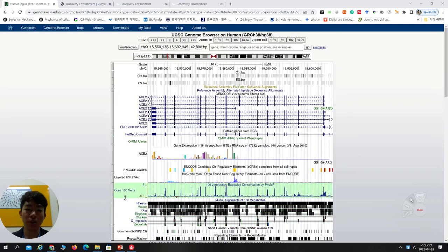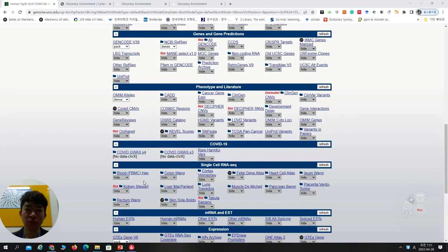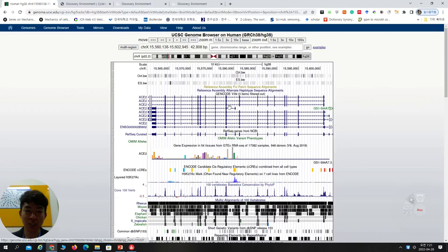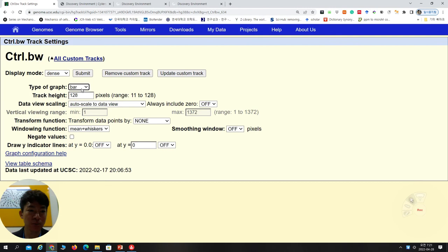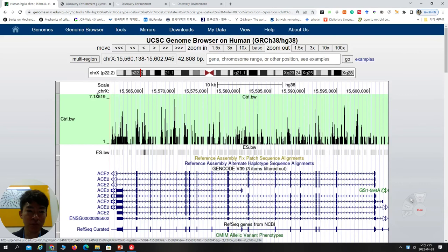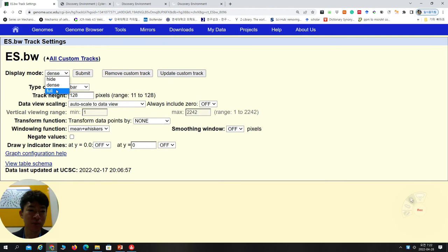If you go here, there are many, many public things — it's very hard to show one by one. But the important thing is you can click a dense file to make configurations. I'll change it to full mode. Full means like a peak display. Set the track height to automatic, and the window function to mean only, then submit. Now they display like this. I can try the second file too — set to full mode and mean, then submit.